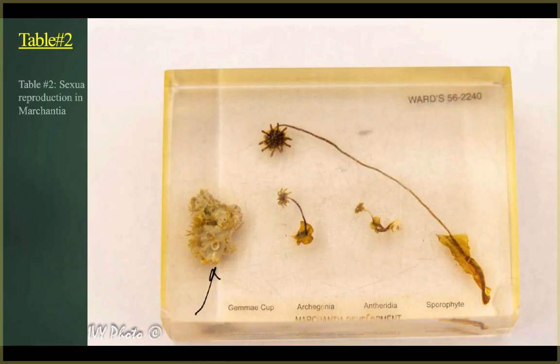Right? And that's the thallus that's on there. And then you have the archegonia here and antheridia here. And so look at these caps. And if you remember, female look like you take it out in the rain, right? And that's how you can distinguish between them.